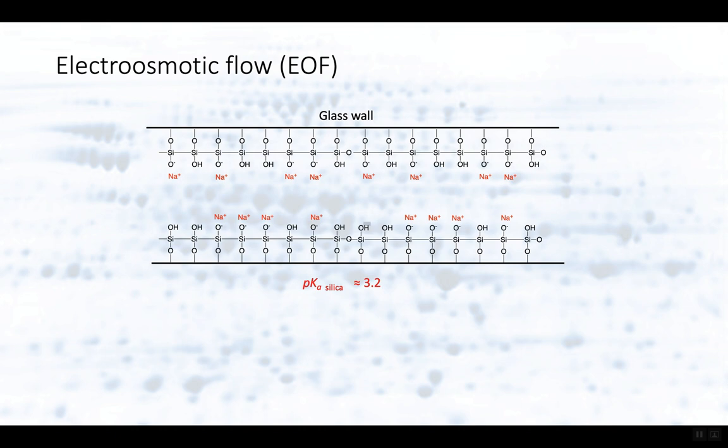Now, what do you think happened? Now, the wall is fixed. The charges on the wall are fixed. They're part of the silica matrix of the glass. But the charges adjacent to that wall in solution are not fixed. So what happens when we slap an electric field across this? Well, we put an electric field across this, and those positively charged ions that are just floating around near the wall, as a Debye layer, they say, "Oh, I see a field strength. Yahoo, I'm going to start running."